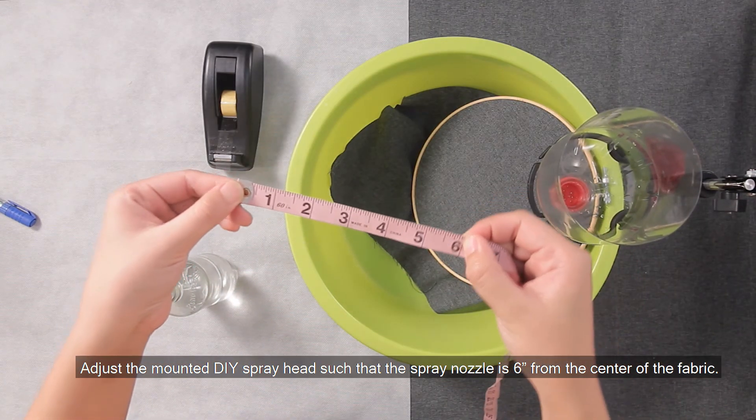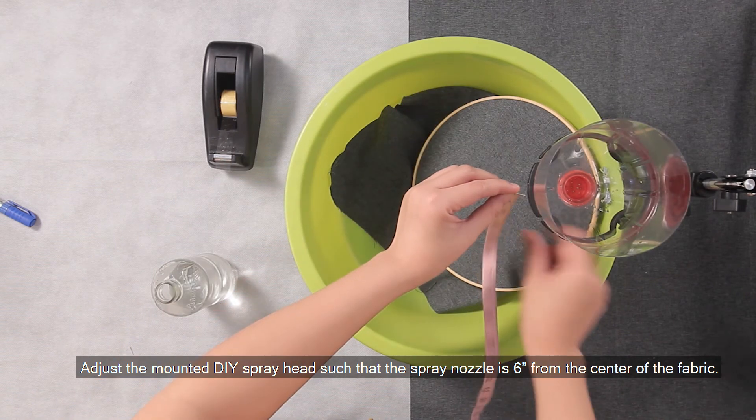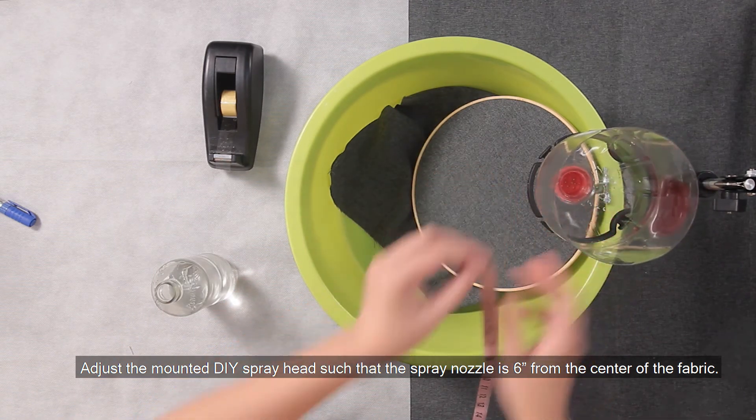Adjust the mounted DIY spray head such that the spray nozzle is 6 inches from the center of the fabric.